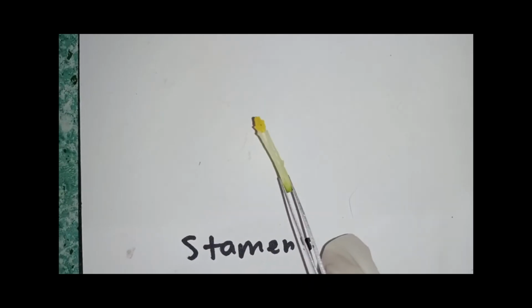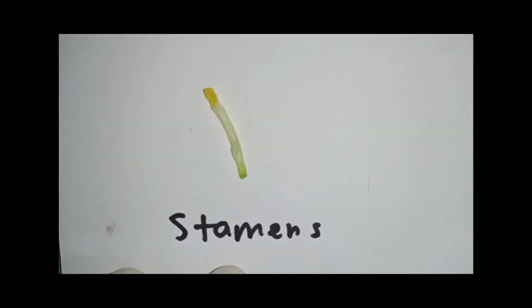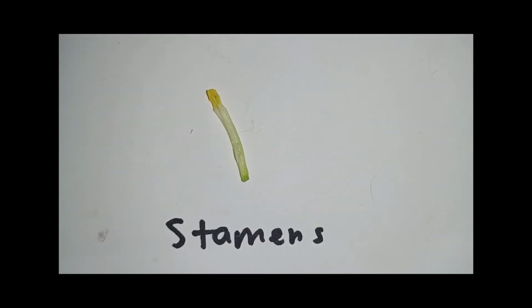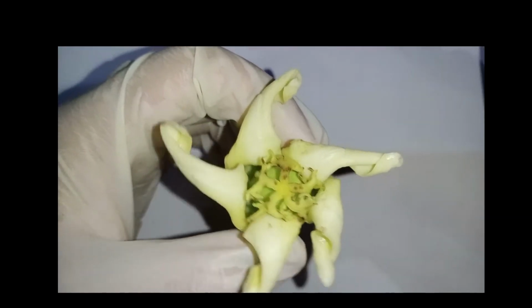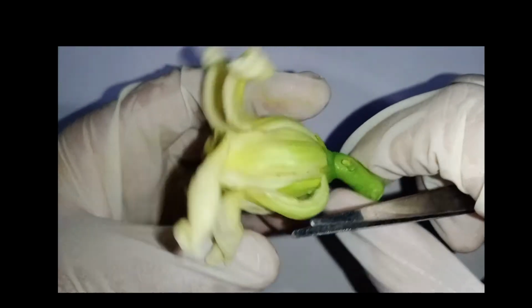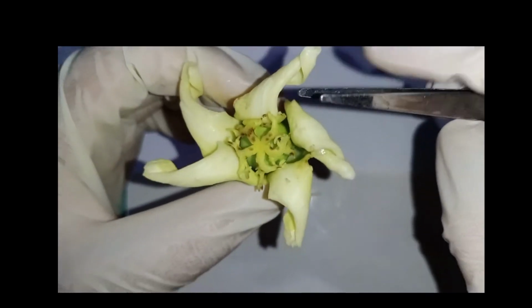So the stamen is the male reproductive organ, consisting of two parts, the anther and the filament. Next we will do the female flower dissection. First of all, this is the overview of the female flower.